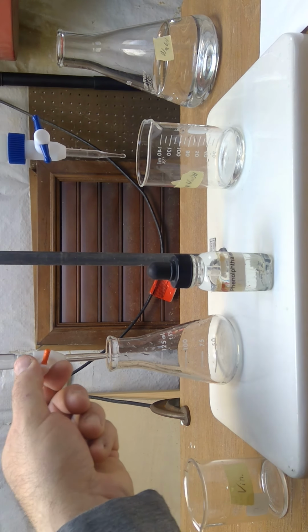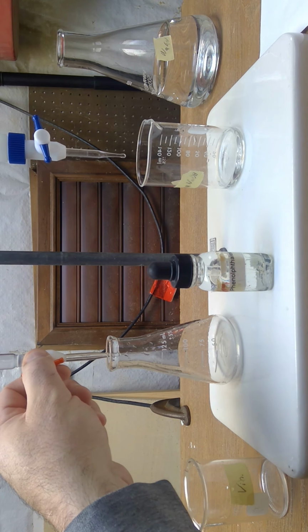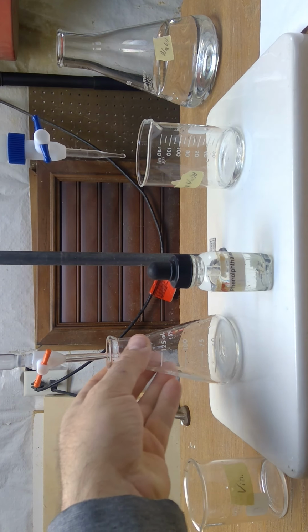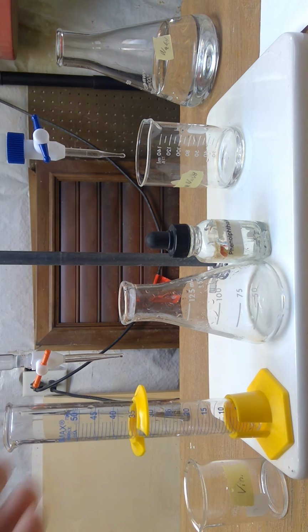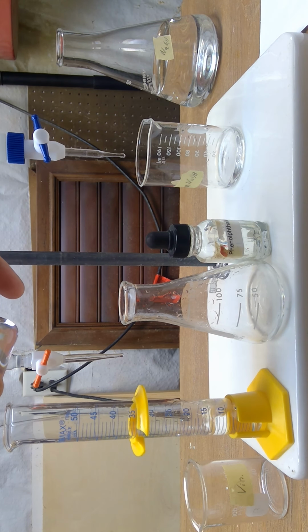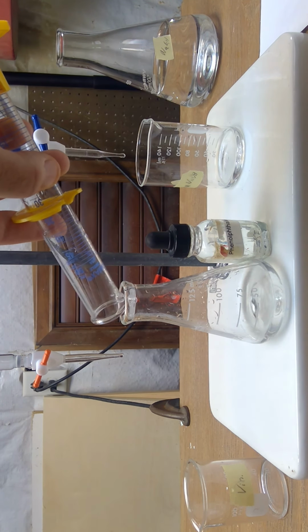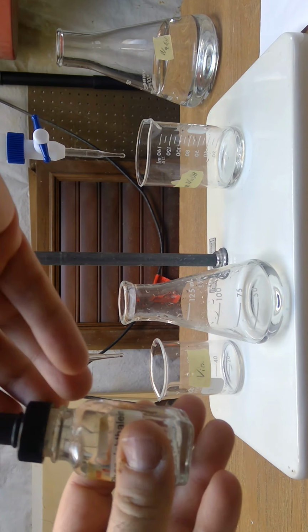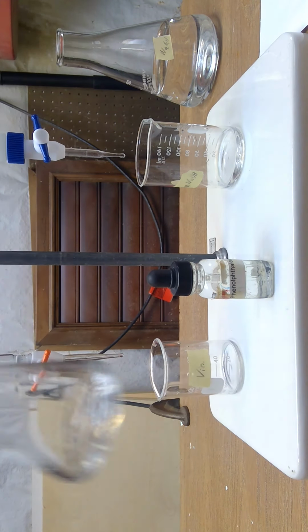So we need exactly 2 milliliters again. So we're going to go down to 36.00. There's exactly our 2 milliliters. Again, we need 20 milliliters of water. We need our 3 drops of phenolphthalein. 2 or 3 drops, doesn't really matter. And we're ready to start.